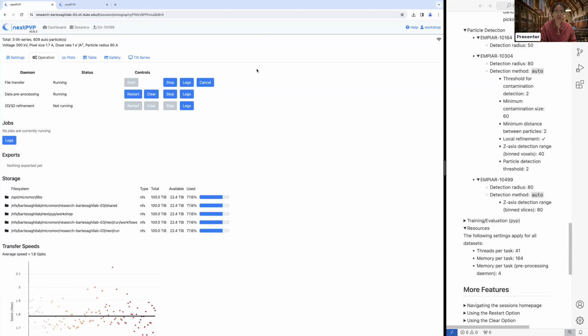But because the pipeline is automated, once you set up the settings, you can just set it and forget it. But don't forget it if you want to monitor the quality of your data. You don't need to go in and change settings after they've been set the first time, or manually do the file copy yourself, or do this job launching yourself.